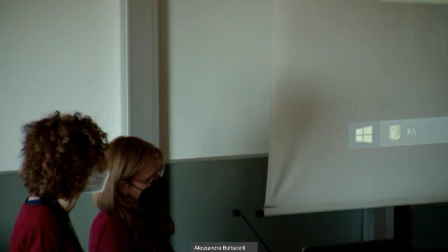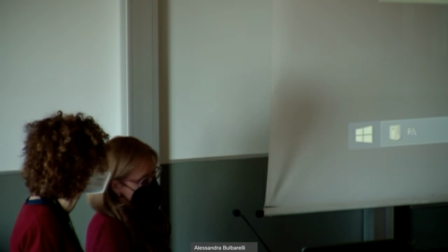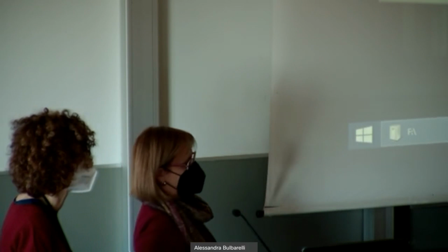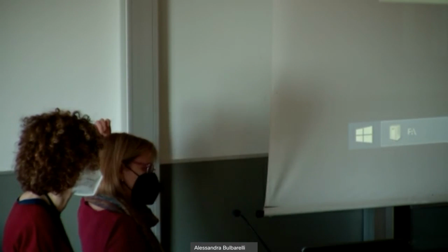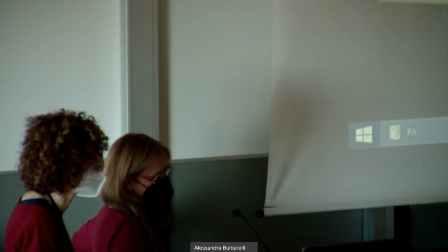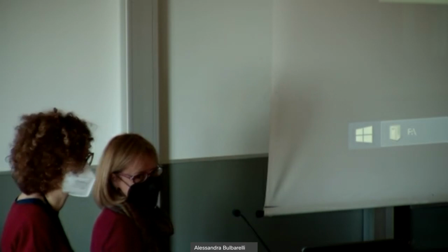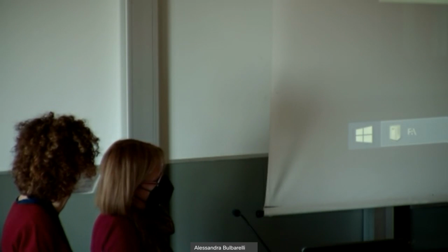But yeah, there are still quite a lot of practical questions to be able to do it in a completely unsupervised way. But I think the main idea is not just to do it completely unsupervised, but to have an extra number or an extra parameter to be able to rely on if you have doubts about some specific diagnosis. And so it can just be an extra tool to add to the normal visual inspection of the biopsy.